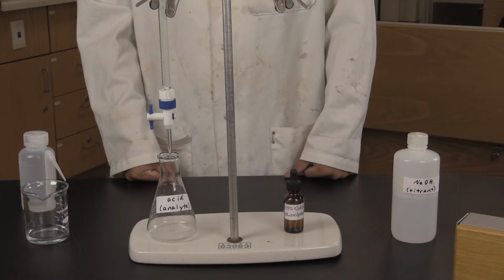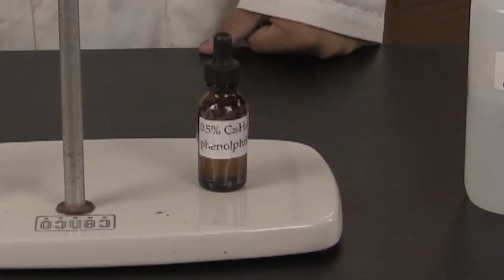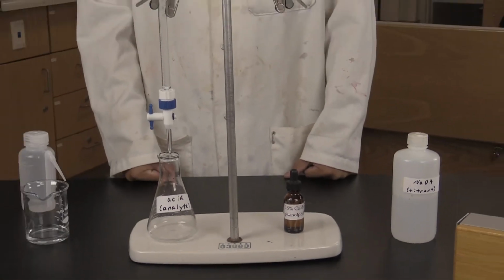In this case, the acid is hydrochloric acid, which Lloyd has carefully measured 10.00 milliliters of into the flask using a 10 milliliter pipette. In order to determine the endpoint, which tells us when to stop the titration, we'll need an indicator solution. In this case, we'll use a solution of phenolphthalein.